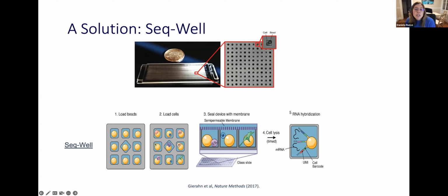We call these little boxes sub-nanoliter wells, and the purpose is that they can really accommodate one bead into their well. And this allows for a really high single bead loading efficiency, which is at about 95%. Cells are also gravity loaded, and due to the size of these sub-nanoliter particles also helps increase the capture efficiency to a rate of about 80%.